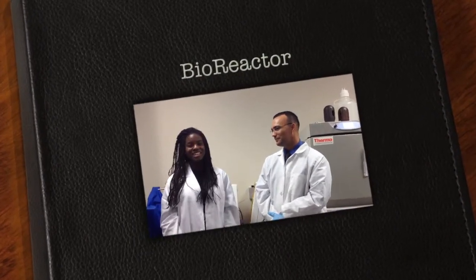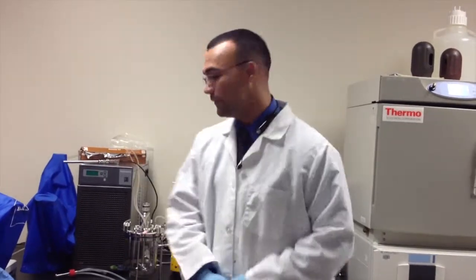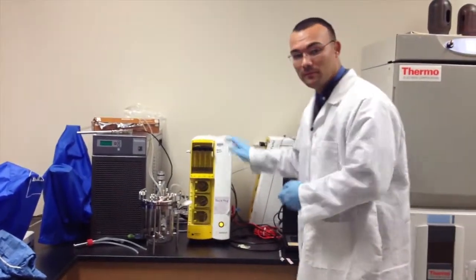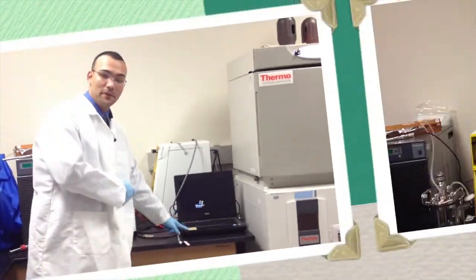And I'm Tanya Chatelain, and today we'll be demonstrating one of the common tools used in the laboratory, the bioreactor. Okay, the bioreactor is broken into three main components. The first component is the actual bioreactor. The second component is the desktop. And the third component is the laptop.